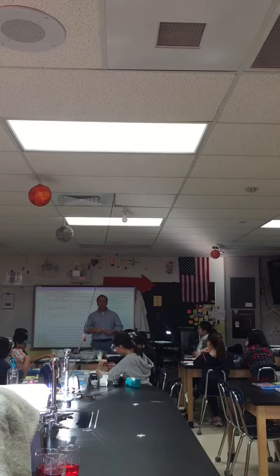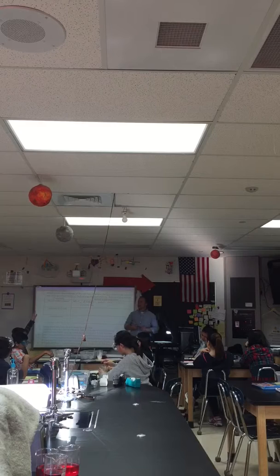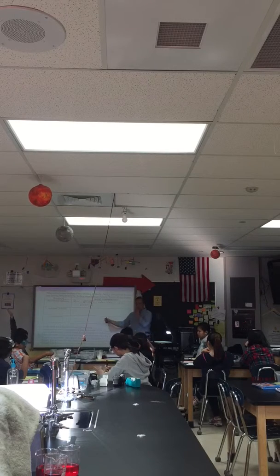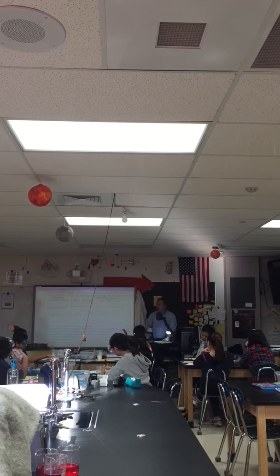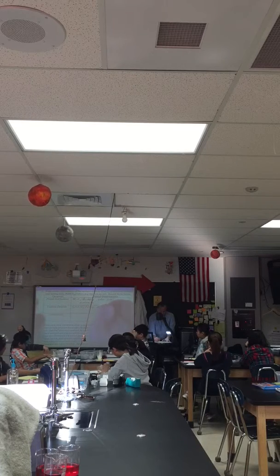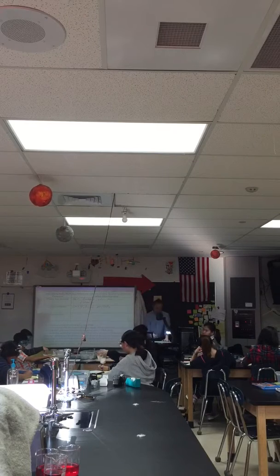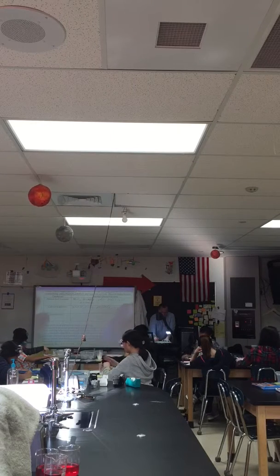Calcium chloride, the CaCl2. Can somebody give me a qualitative observation? Ali, qualitative observation for calcium chloride. There's like these small, tiny pellets. Small, tiny pellets. Okay. White. Excellent. Obviously, white. Yes. Perfect.